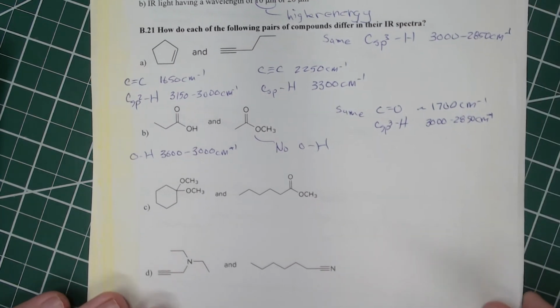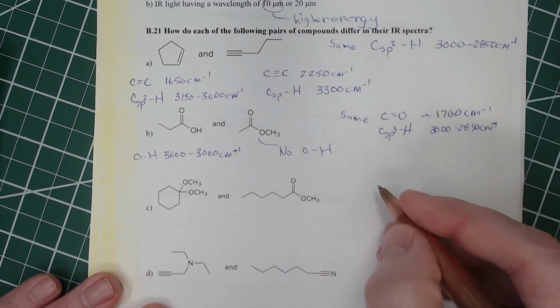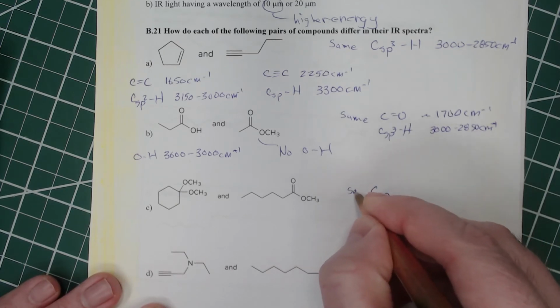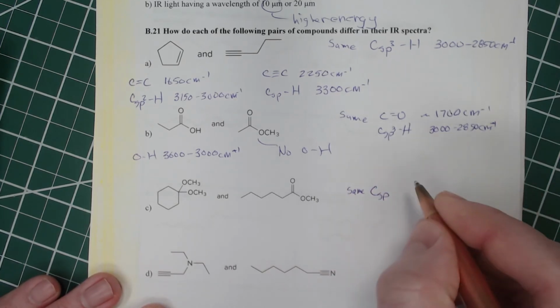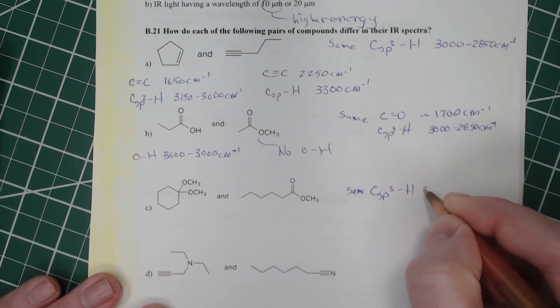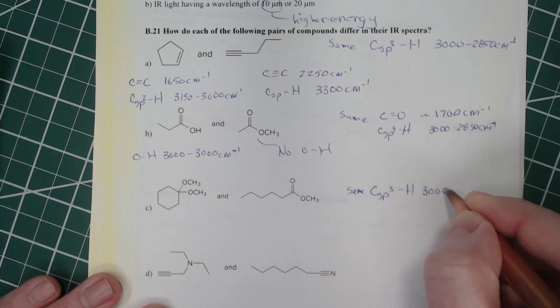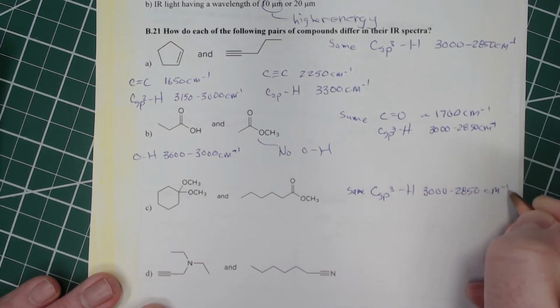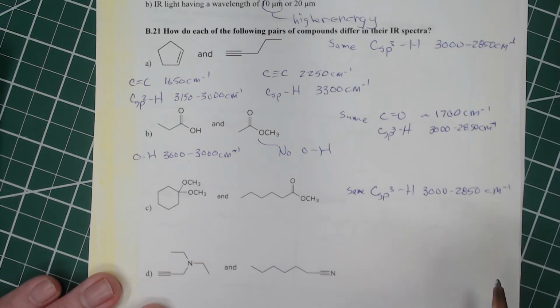All right. For this one, things that are going to be the same: definitely carbon sp3 hydrogen from 3000 to 2850. And then that's it as far as what's going to be the same.